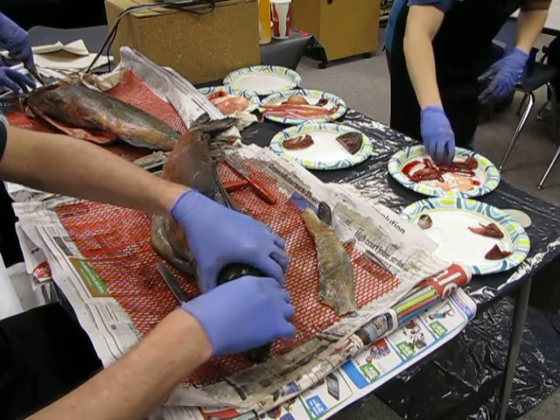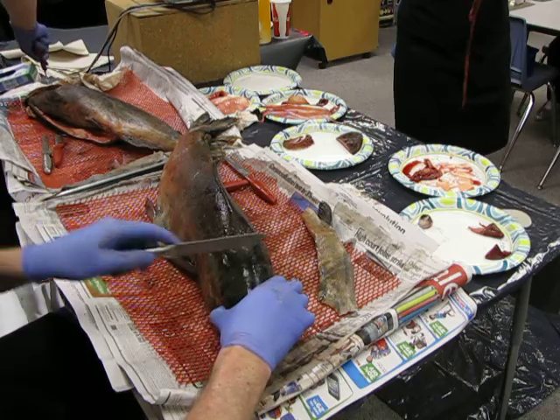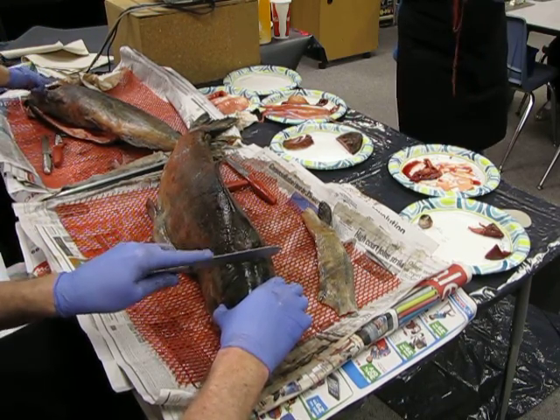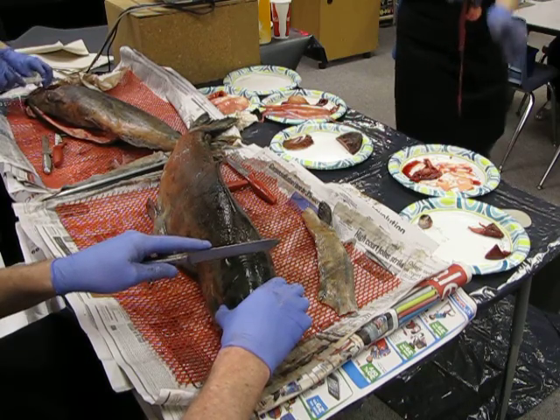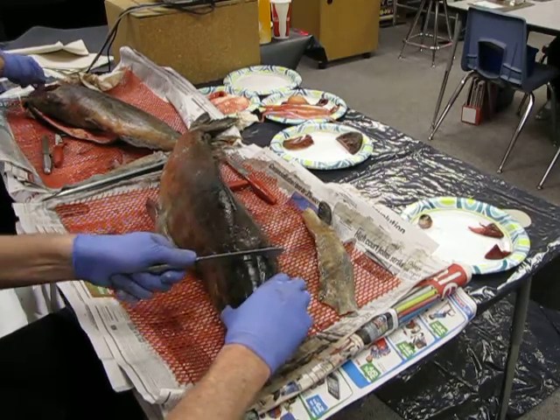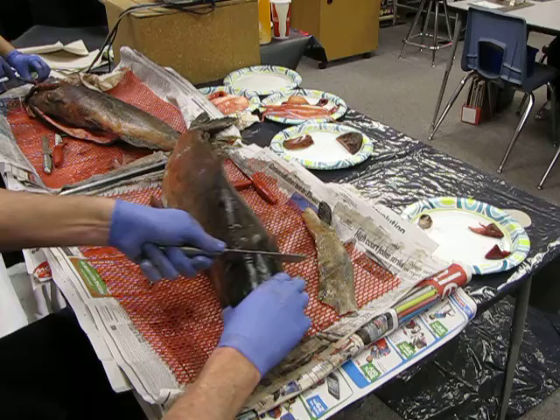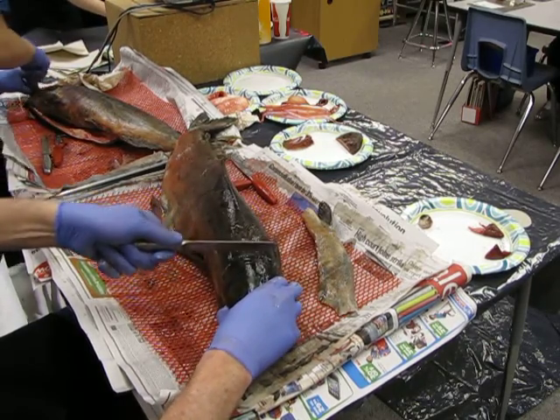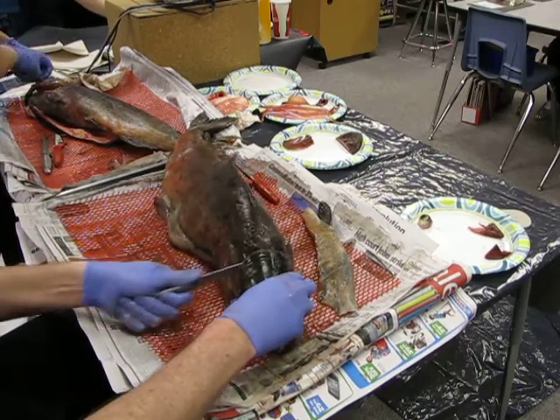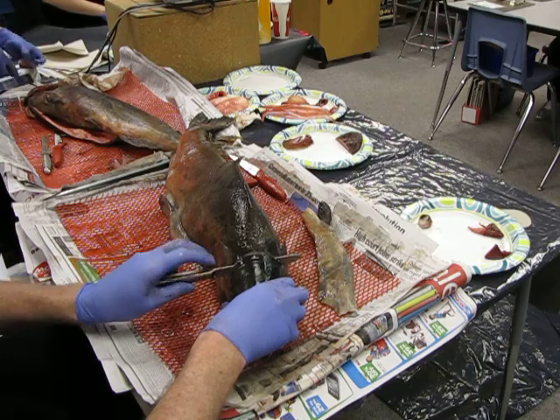So their stomachs, when they do eat something and it slowly starts to break down and move, they have a helper. I think of it kind of like a second stomach. It's a bunch of stringy things here. I'll put it under here because I think it might be easier to see. Do you see that? Just a little down, please. Towards you. Okay. You got it there. Right there. Do you see how it kind of looks stringy?